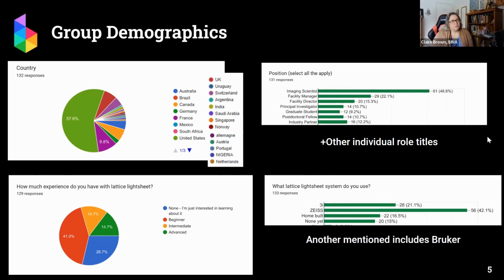And then we have a distribution of people working kind of close to half and half, I guess, on home built or 3i built systems built around the Janelia model and the Zeiss system. And then, as I mentioned, about 15% are here to learn more, so may not have a system.